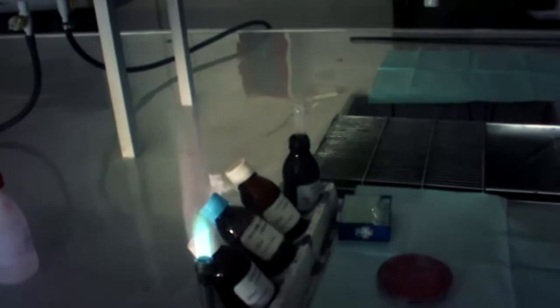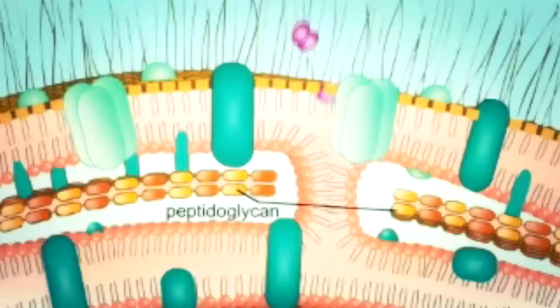Part two of three: performing the Gram stain. Step two, part one — flood the smear with crystal violet. Use a pipette to flood the bacteria sample with several drops of crystal violet, then wait 30 to 60 seconds. Crystal violet dissociates in aqueous solution into crystal violet positive and chloride negative ions. These ions penetrate through the cell wall and cell membranes of both gram-positive and gram-negative cells, and the crystal violet positive ion interacts with negatively charged components of bacterial cells to stain them.